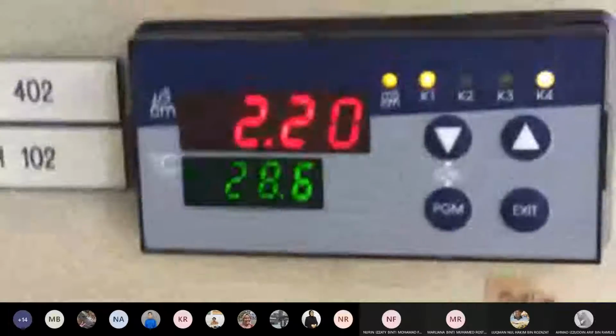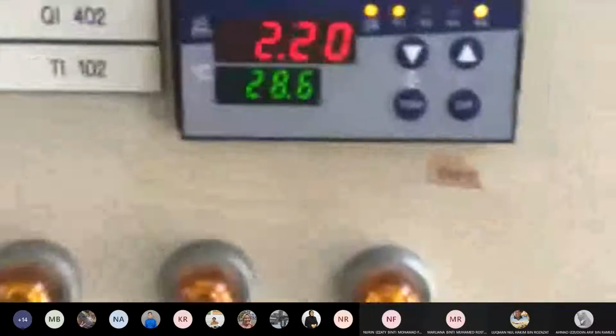So kalau effect of flow rate, okay, kita kena control WAF, right? So the WAF is controlled here. Saya check. 302, 303. Okay, sorry. So 302 I think sodium hydroxide. 303 is for ethyl acetate. So this is the flow indicator. Flow sensor dia kat sini.